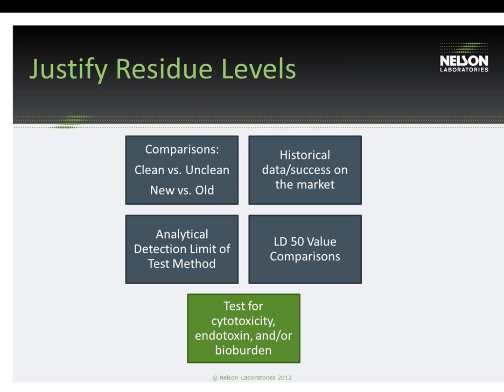And so that's something to be cautious about with these test methods and using that as your justification for a clean device. And on a side note, in terms of sample size for these test methods, with the analytical test, there's no set sample size requirements for what you have to send. However, one of the tests we will be discussing next, the cytotoxicity or MEM elution test, does have an acceptance criteria, and we recommend a similar or comparable amount to that cytotoxicity test to show comparable results, which we will touch on later. And so that's a recommendation in terms of sample size for surface area or weight for these tests.